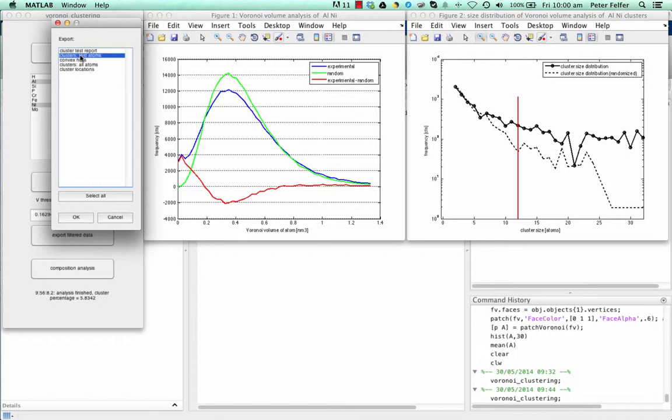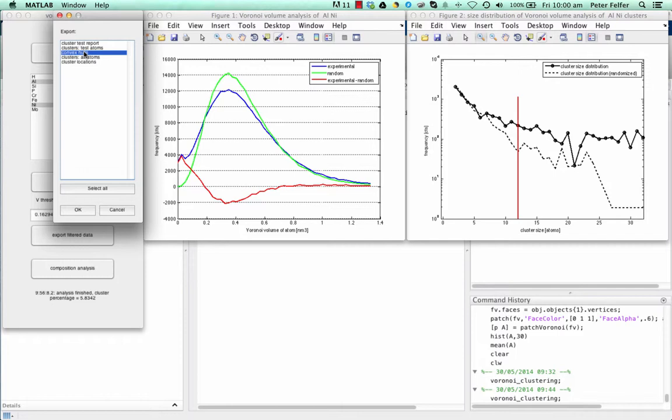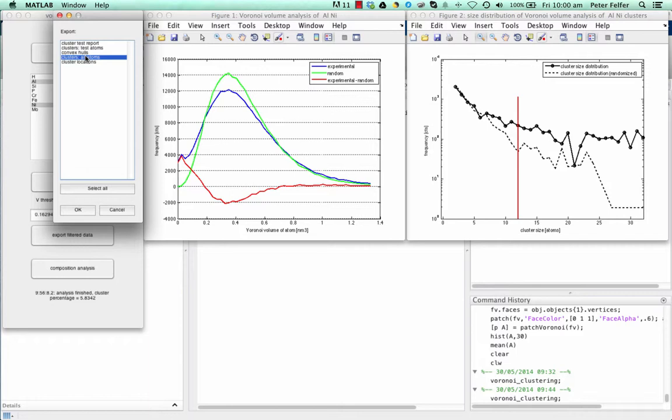Cluster test atoms exports the clusters, and only, in our case, the aluminum and the nickel atoms. The next thing is the convex hulls. It creates a convex hull, which is a mesh around each cluster. Since most clusters are actually convex, you can use these convex hulls to calculate proximity histograms, volumes, or other things from your clusters. Or clusters, all atoms, means it takes all of the atoms that are within the convex hulls of the clusters. If your clusters are not convex, this is a bit of an issue, so you can't really use that then.